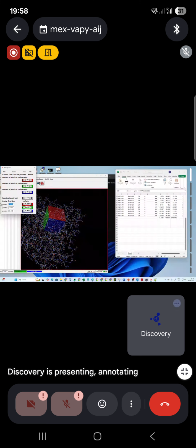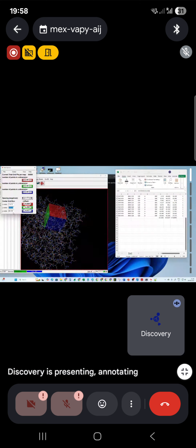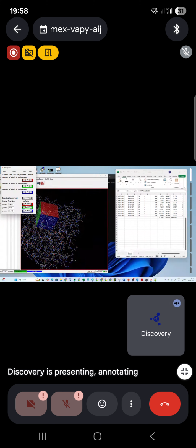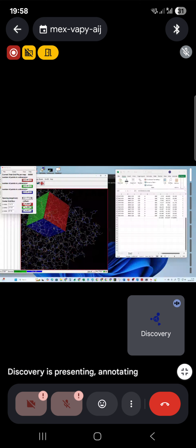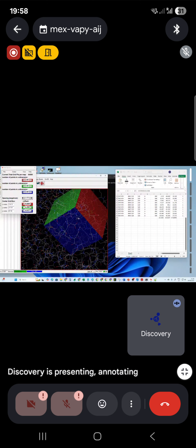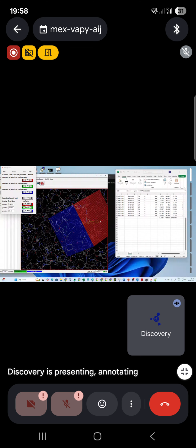So here, if you type here minus 14.10, okay, and then in the Y center minus 43.83, and Z center 27.66. Right. So now you can see there's yellow star here. No, this is the center of the grid box, and now we have placed exactly at the centroid of the ligand.